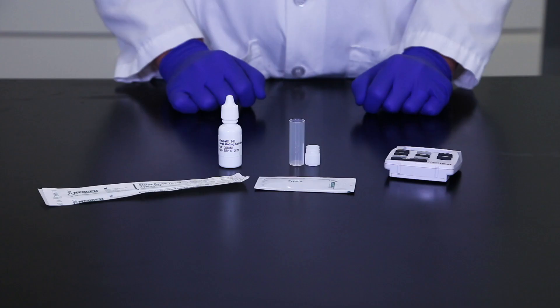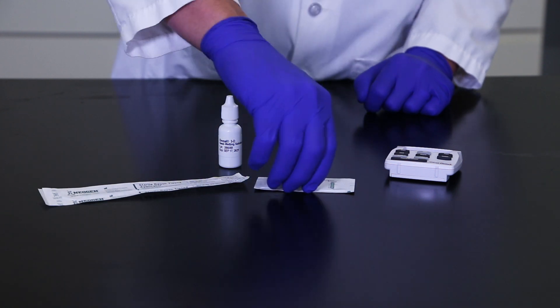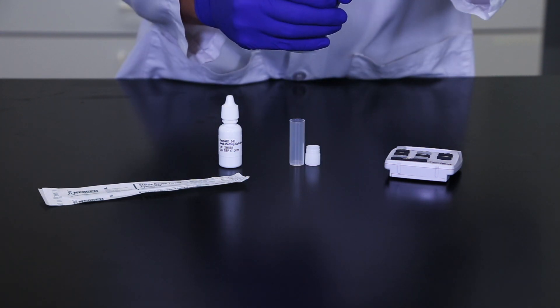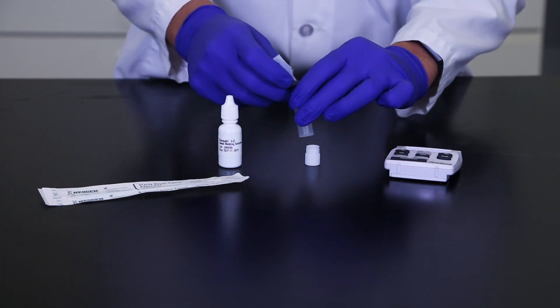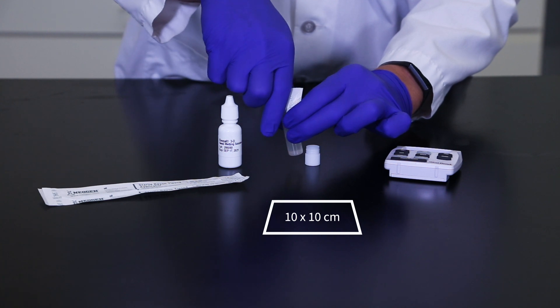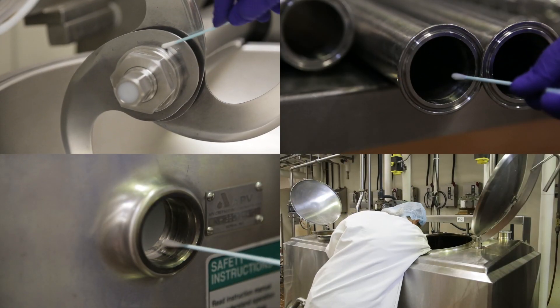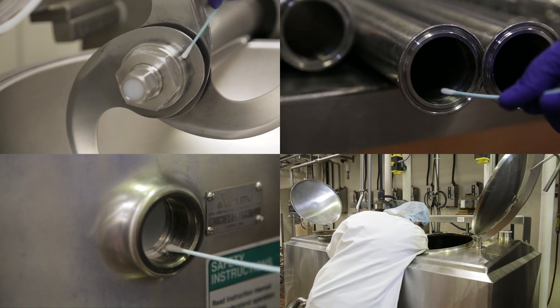Remove the test kit from refrigeration and allow it to reach room temperature before use — this generally takes 20 to 30 minutes. You'll need one sample tube and cap, one sterile swab, and one extraction buffer for each environmental surface you want to sample. Carefully tear or cut off the top of the extraction buffer sachet and add the entire contents to the sample tube. If testing a flat surface, estimate a swabbing area of approximately 10 by 10 centimeters. Alternatively, use the swab to collect samples from problem areas like processing equipment, mixers, or filler heads.